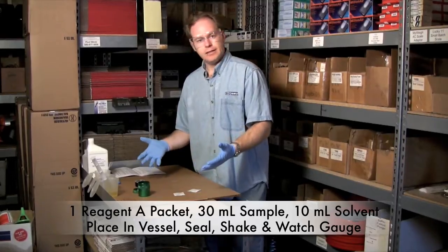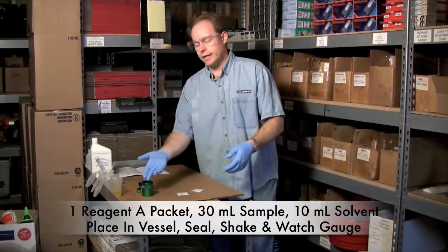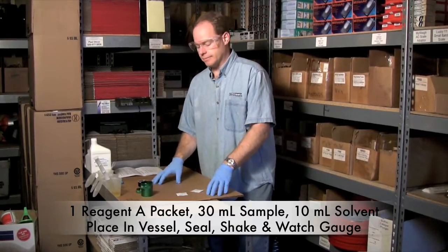The kit does come with safety gear and it's important to wear it. I've got safety glasses on and I've got safety gloves on. We are creating a little bit of pressure here with some hydrogen, so it's important that you be sure and be safe.